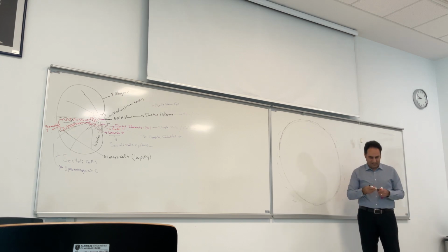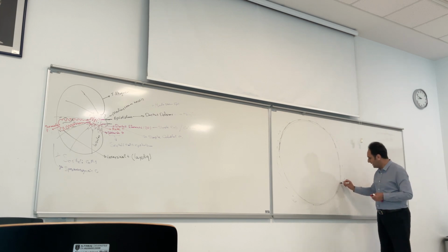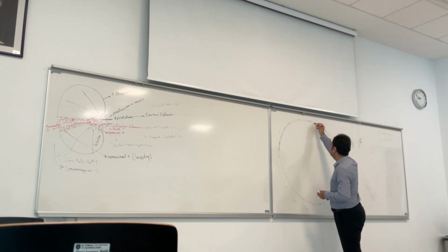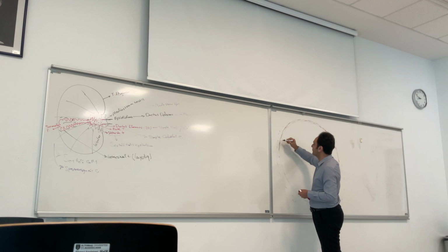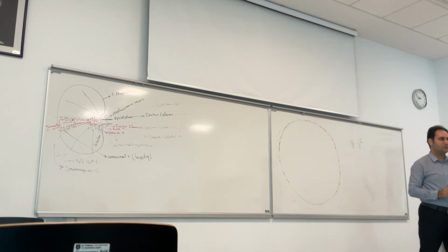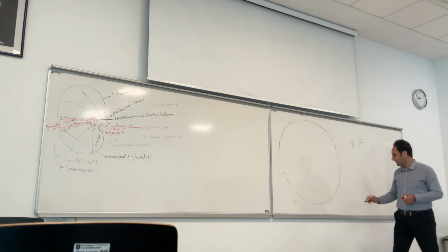On the inner side of this connective tissue, in some areas, we have myoid cells. Myoid cells have the capacity to contract and help seminiferous tubules to contract and push newly formed spermatozoa toward the rete testis, ductus efferentes, and epididymis.